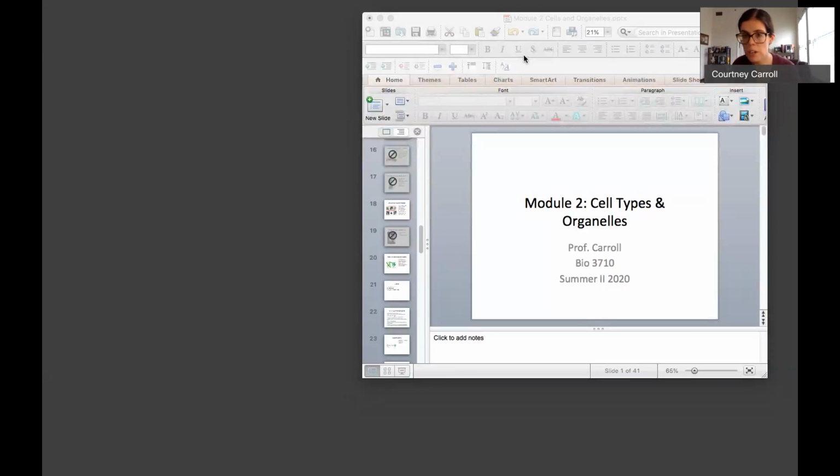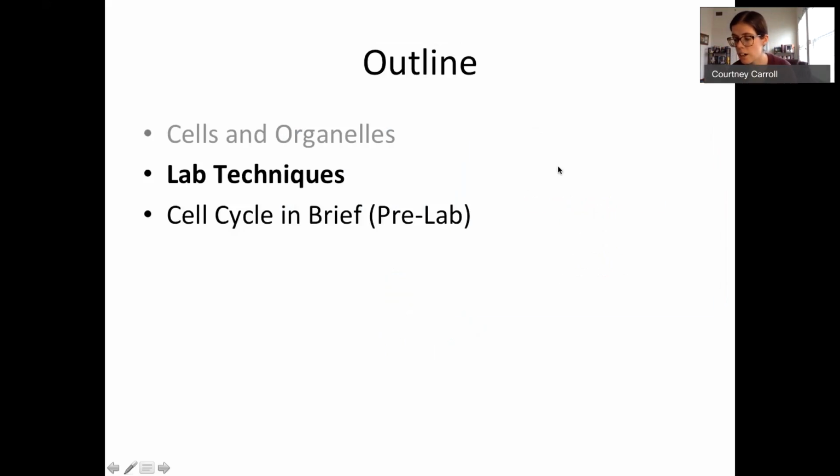In this video, we're going to discuss DNA, RNA, and protein-based lab techniques. The goal is to introduce you to the technology, even though at this point in the course, some of it may not make total sense. We will come back to many of these techniques throughout different modules, and I'm also going to link some helpful videos that you can watch if these methods don't make sense.